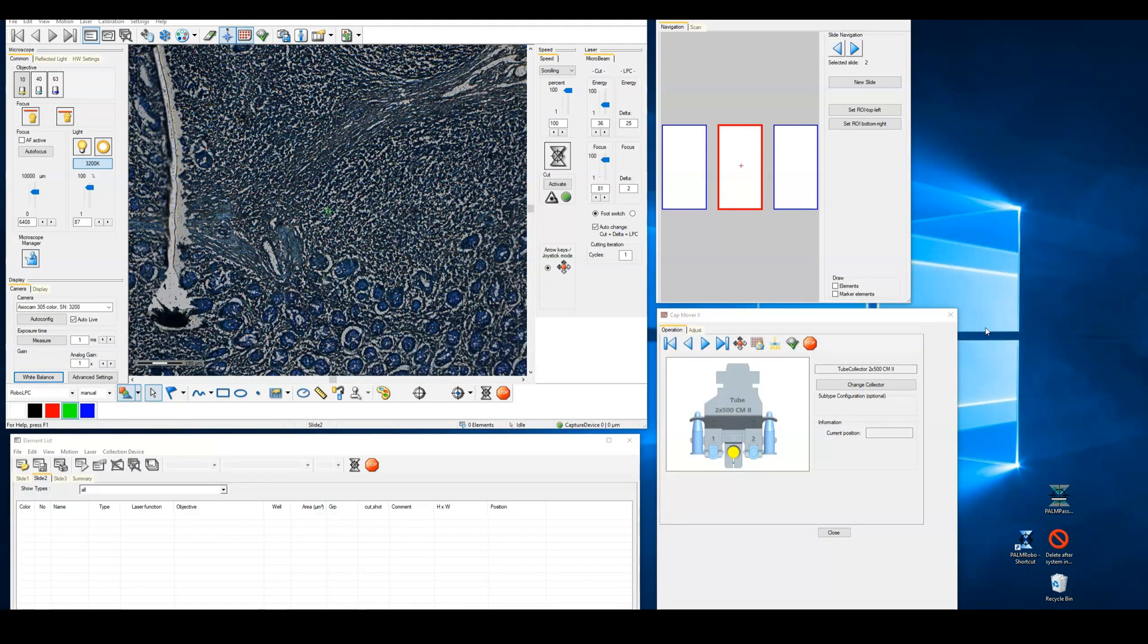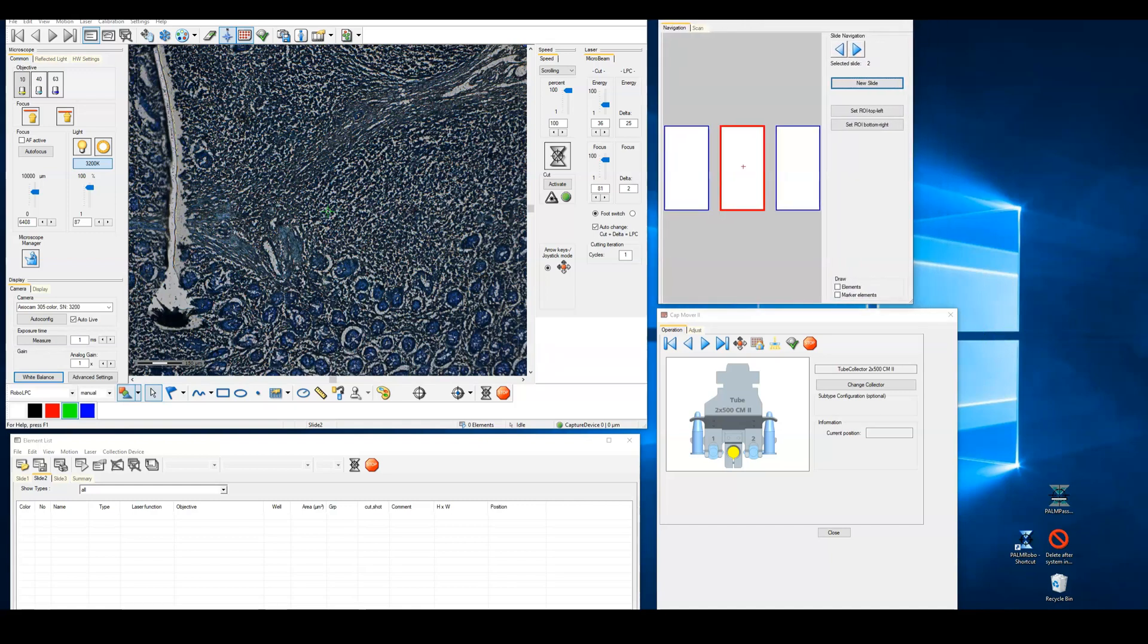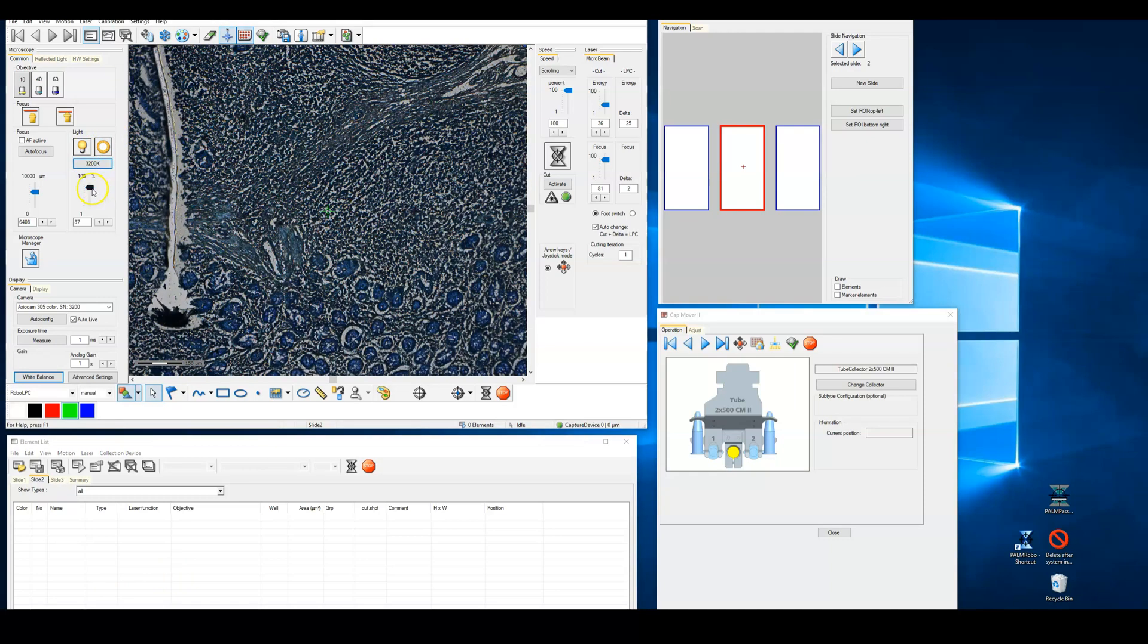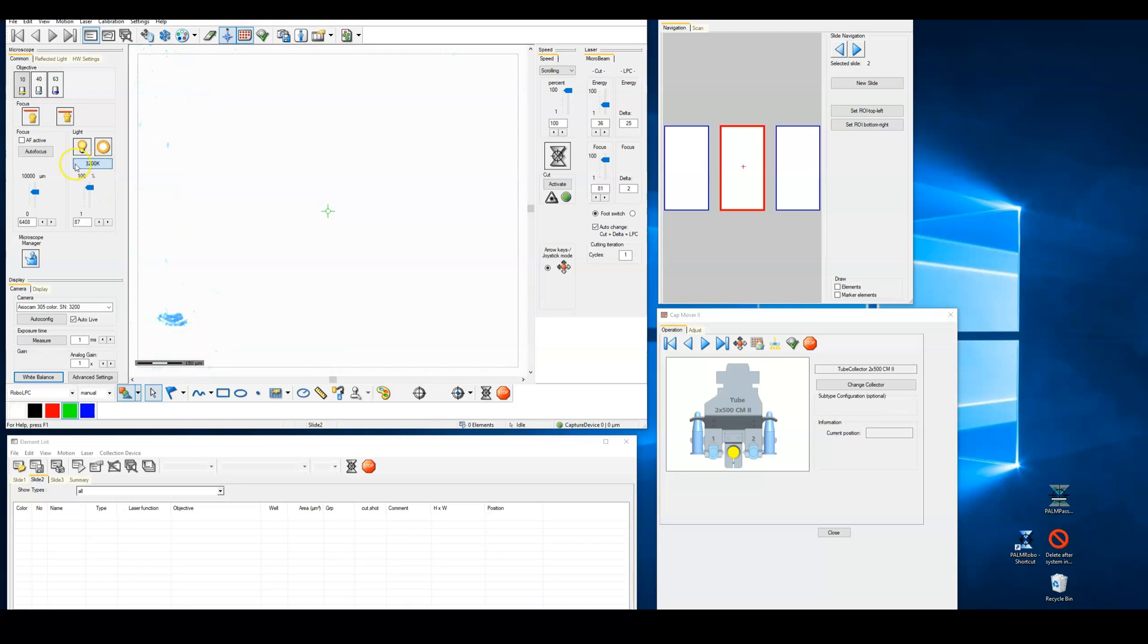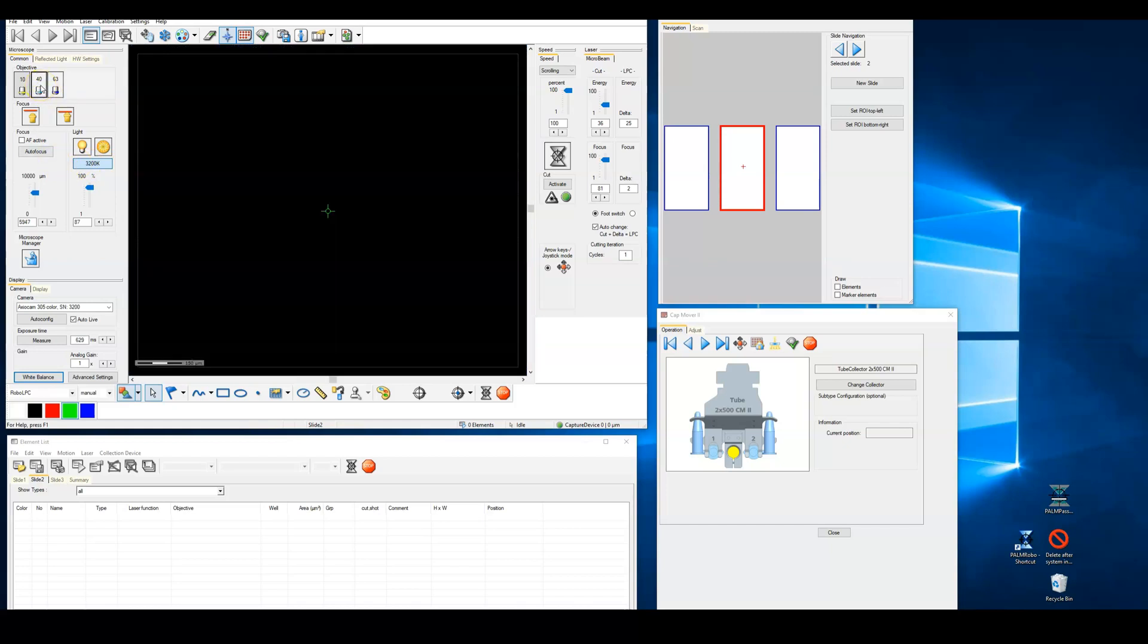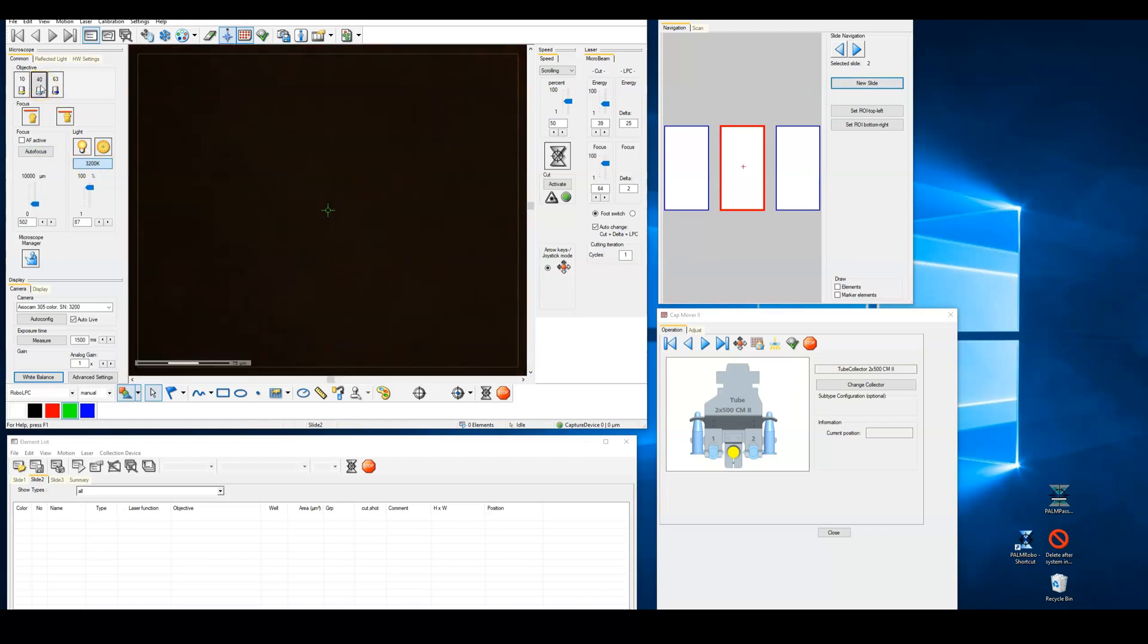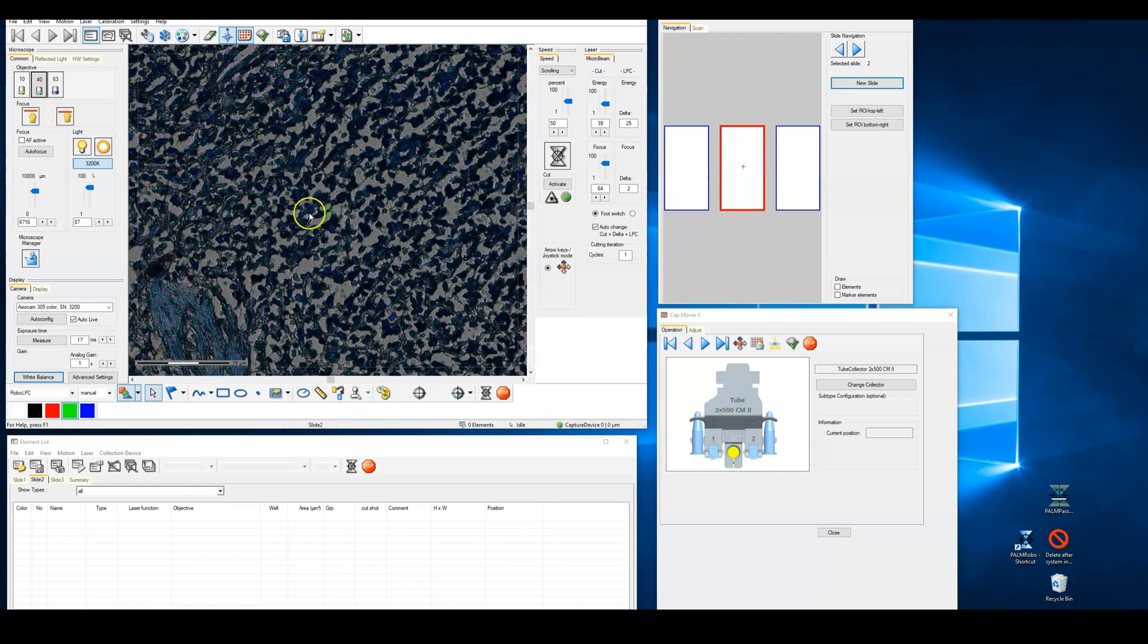Arrange the control windows to your comfort. I suggest the following arrangement is most convenient with the navigation directly to the right of the main window and the elements list below the main window. On the left side of the RoboSoftware main window, set the light intensity to 3200 Kelvin. With the neutral density filters in place and 3200 Kelvin light intensity, the auto exposure of the color camera should permit us to change between objectives without having to adjust the light intensity. This makes for an easy workflow when navigating your sample.